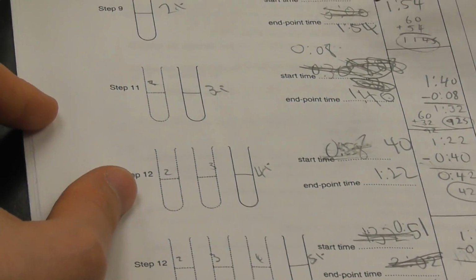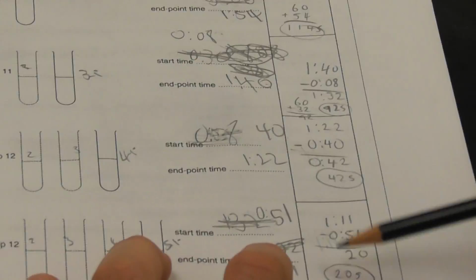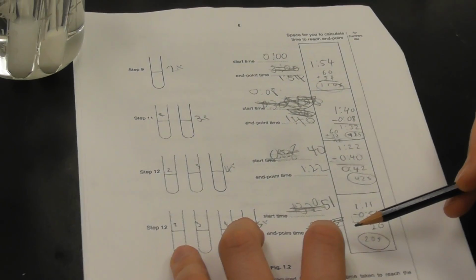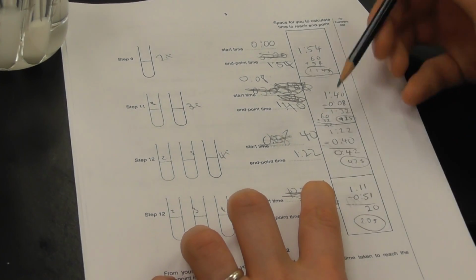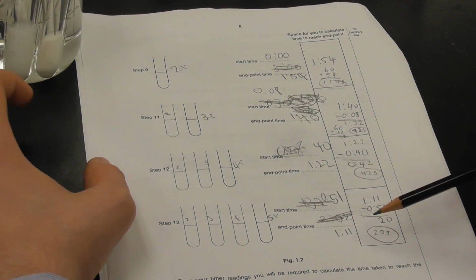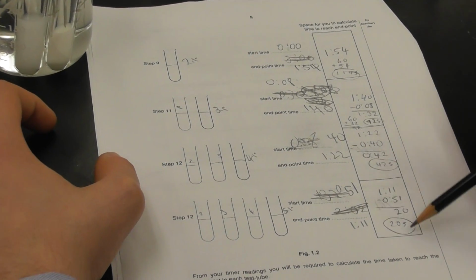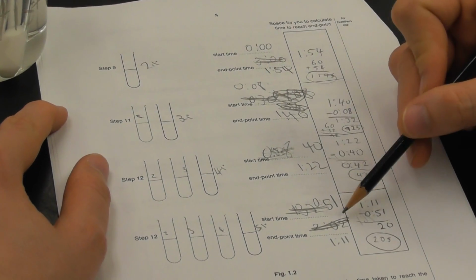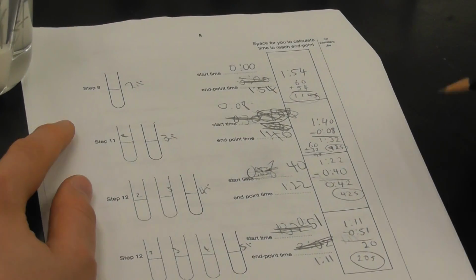So here's what happened. As soon as I put in my step 5, I barely had any time to shake it before putting it back in, and it was almost done. So I had no time to stop the timer, and it was basically gone. So I wrote down the time as quickly as I could. By the way, these crossouts are the times that I thought I had had before, but I just ended up redoing the whole thing, so forgive the squiggles.